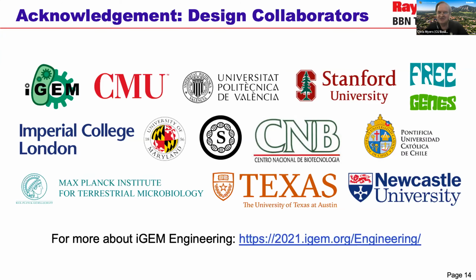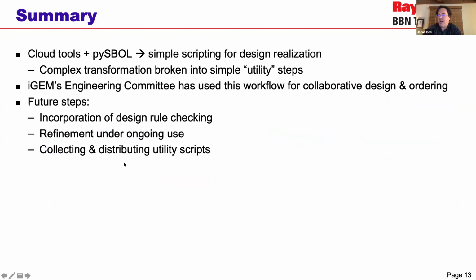Do you take enzyme cutting sites into consideration? That is one of the things that I talked about us wanting to add in. We know that we need to. The first particular run that we did through this, we were synthesizing everything rather than doing a build. The next run that we're in the process of setting up right now, we're going to be doing Golden Gate based builds. And so there we actually will need to be taking enzyme cutting sites into consideration.